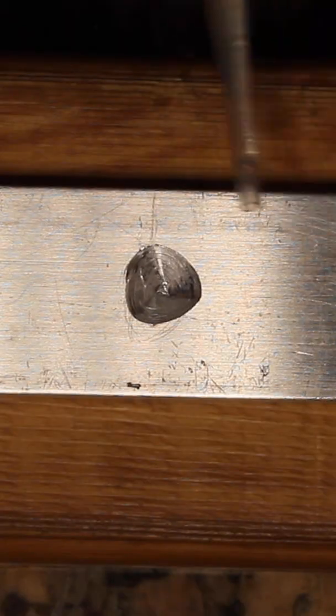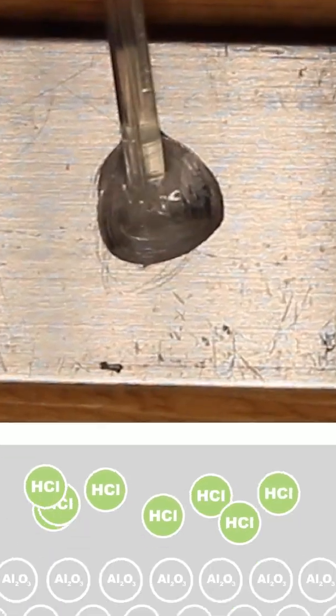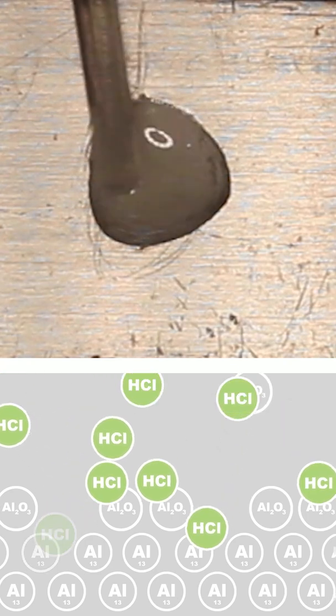After drilling a hole in a piece of aluminum, I use the pipette to add a little bit of the acid into the hole to remove the oxide layer off the surface.